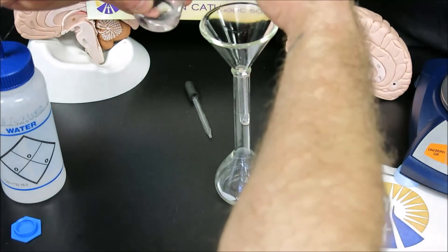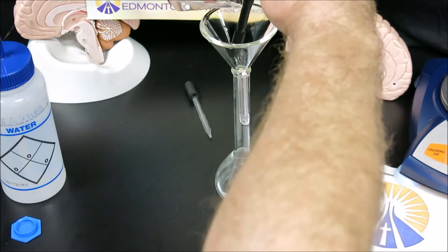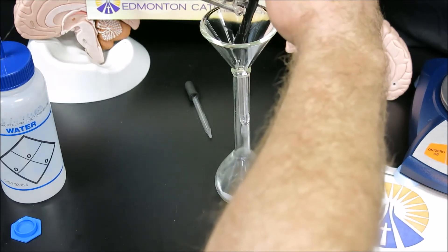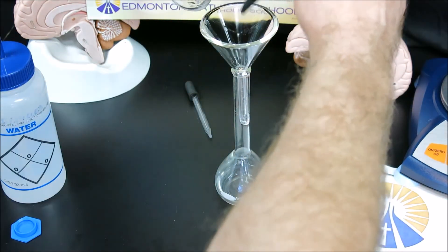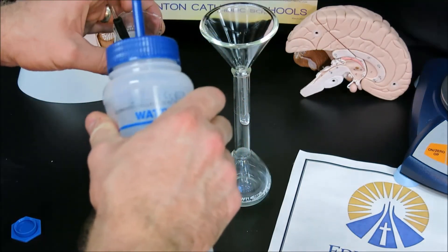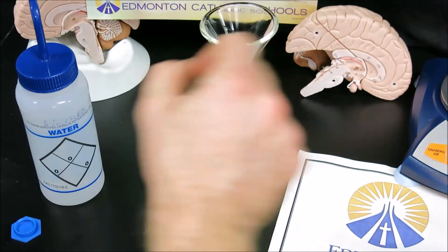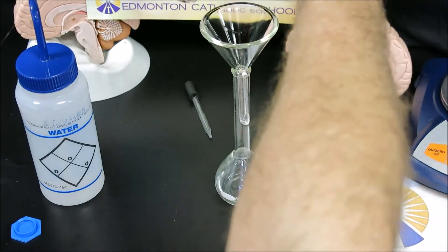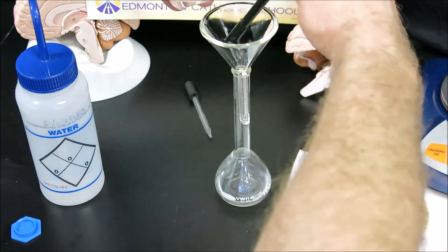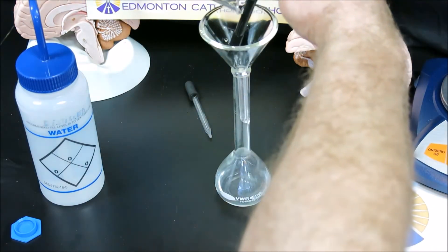Once I can no longer see any solid, I will do three clear rinses to get any remaining molecules that I couldn't see with the naked eye. For each of these subsequent rinses, we use very small amounts of water because we don't want to overfill our volumetric flask, which would force us to redo the solution preparation.